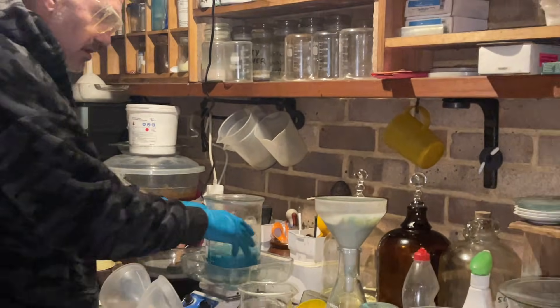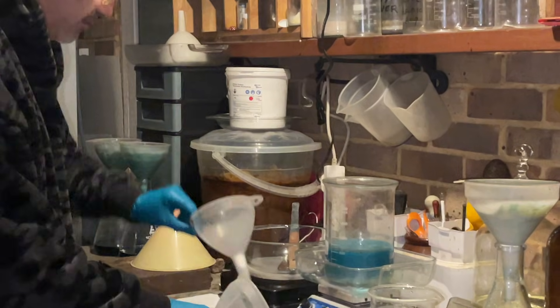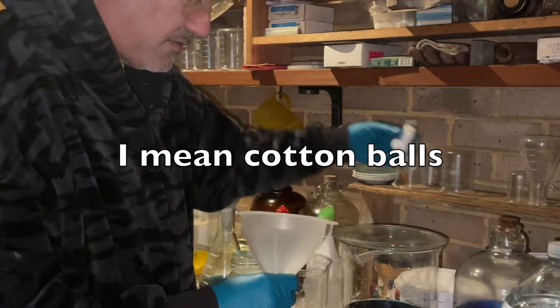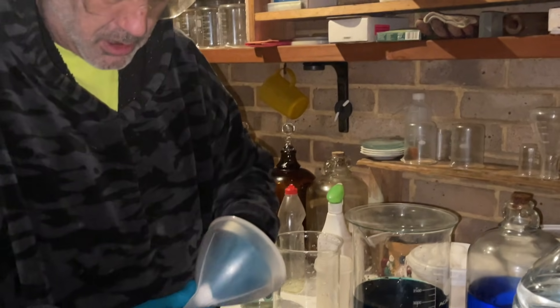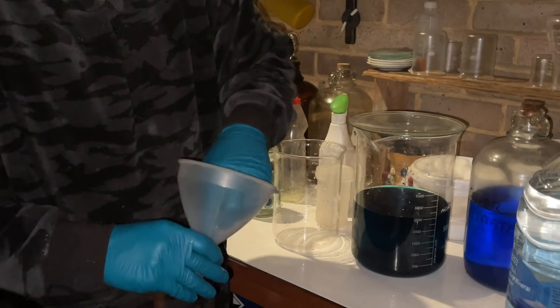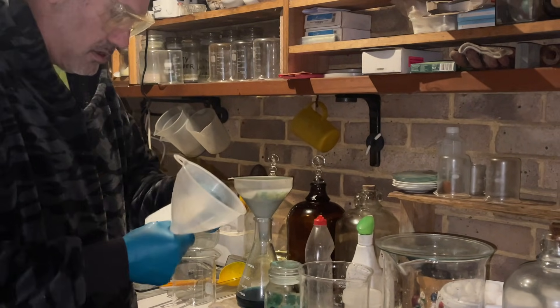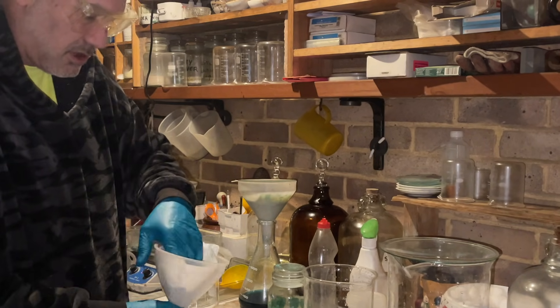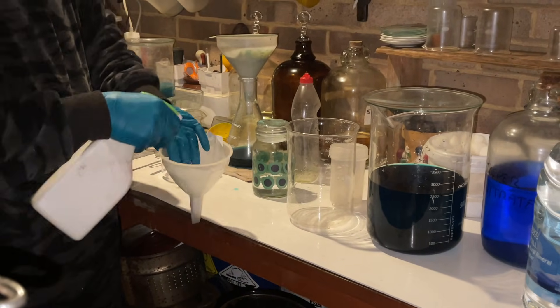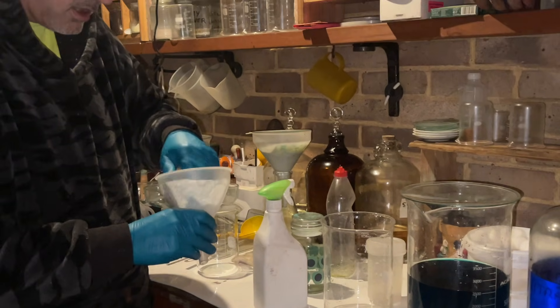I'm going to filter that in a minute. We've got a filter there and two more filters here. I'm just about to make some more filters. What I do is I put the cotton balls in the bottom — for this size funnel I'll use two balls. I'll put them into the funnel and push them in, then get a filter paper, put the filtering on top, get some bottled water, make it wet, and then it's ready to filter. They do get clogged a lot when you're doing e-waste.